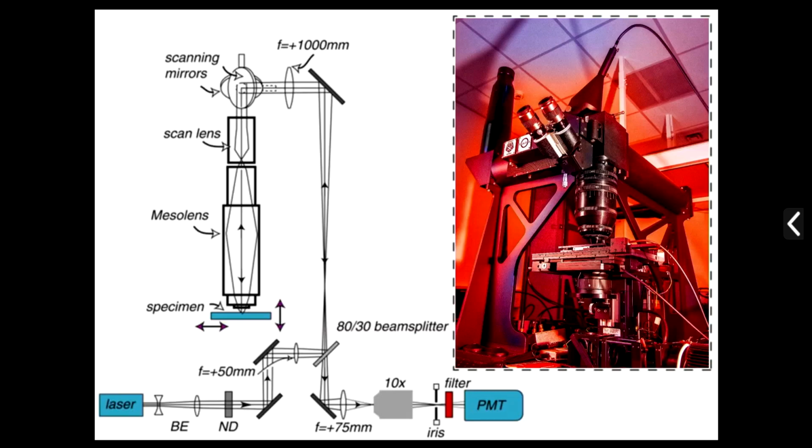Confocal is slow for us because we have to scan so many pixels per unit volume. Even with a very short pixel dwell time, say a quarter of a microsecond, it can take us 1 week to scan an entire Mesolens image volume. And so we tend to work quite a lot with fixed and cleared samples, as I'll describe.